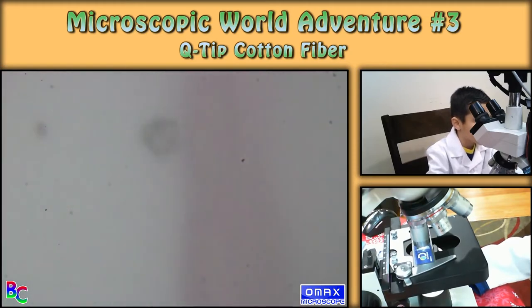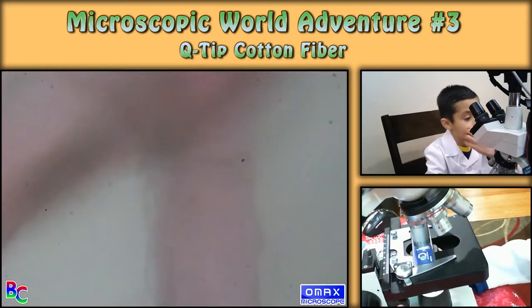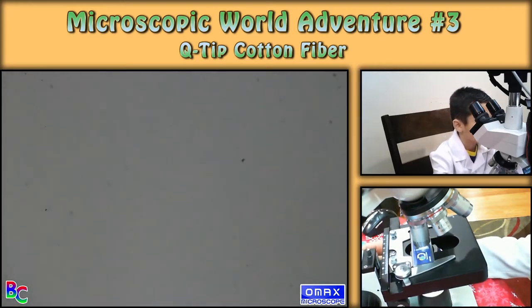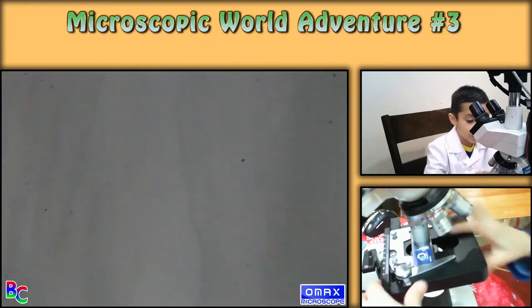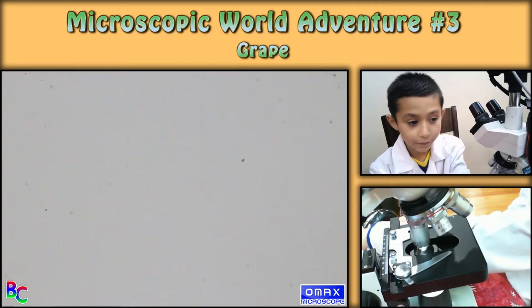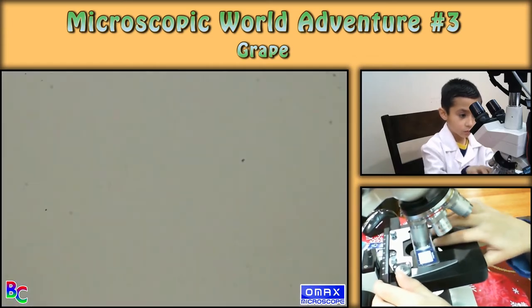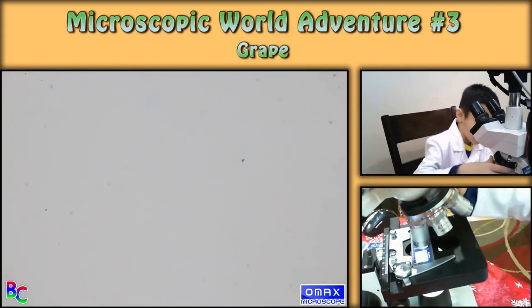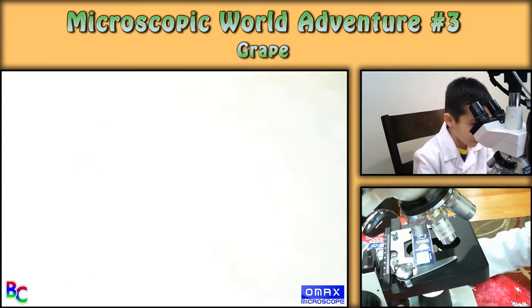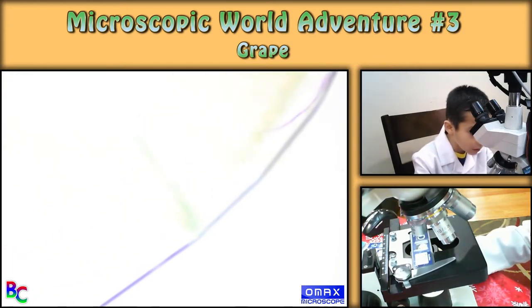Okay, this is like the ink part. And this is all the other hair — hair, I'm guessing. That is number one. Number two I do not know what this is. My dad — I'm guessing my dad put a big piece of this because I could see it. Oh, that's the edge of the tape!